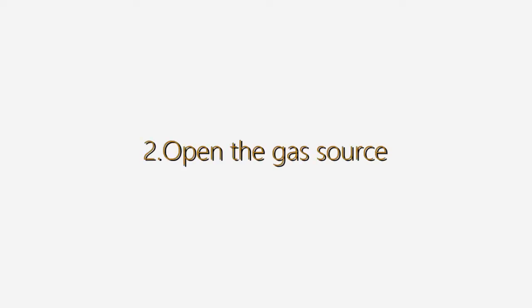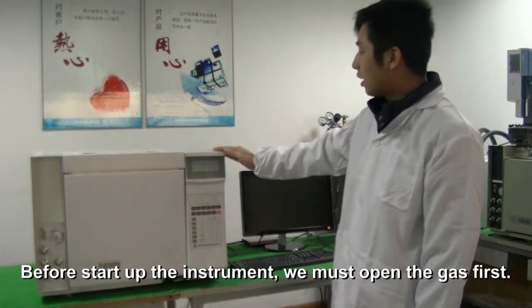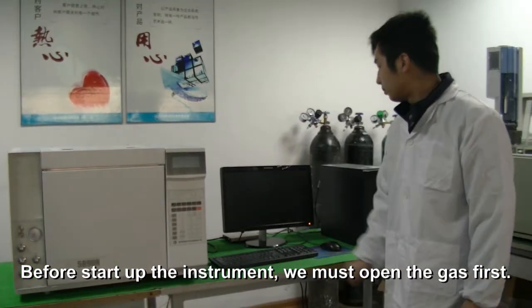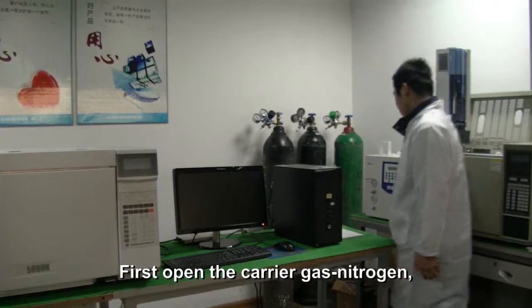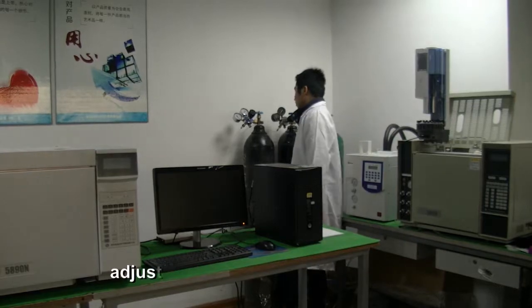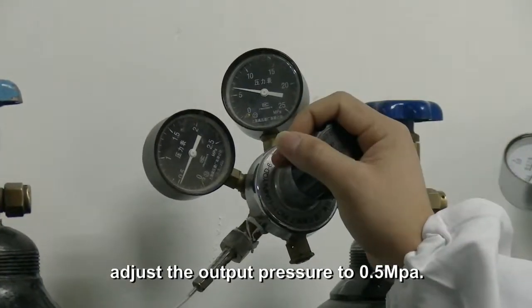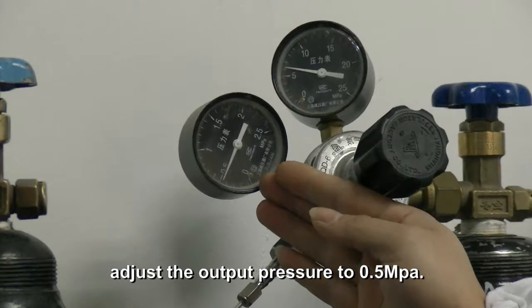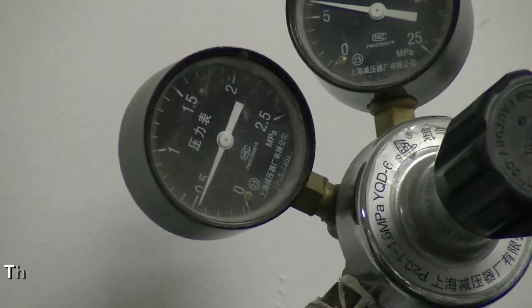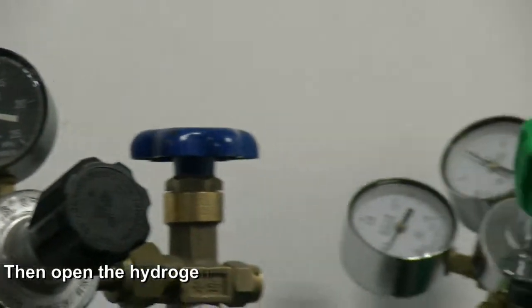To open the gas source, before starting the instrument, we must open the gas first. First, open the carrier gas nitrogen, adjust the output pressure to 0.5 MPa, then open the hydrogen, adjust the output pressure to 0.4 MPa.